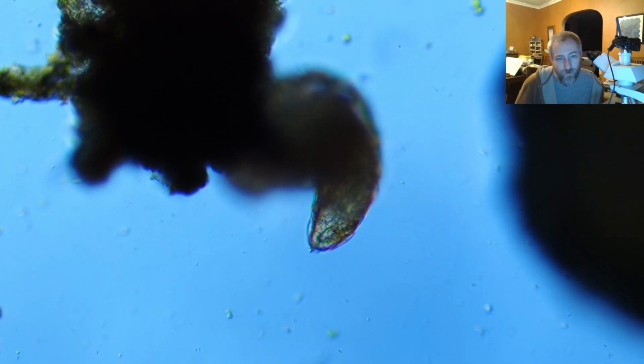Something like 4 or 5 different species that I've seen. So there's this guy with the big sort of antenna off the sides of his face and the prongs. I've seen a smaller one that's like this. And there's a fat one that doesn't have any of those things on its face. And the little guy that we have over there is sort of like that. Anyway, I don't know the names of them. I'm not a water bear expert. I study diatoms, of course.